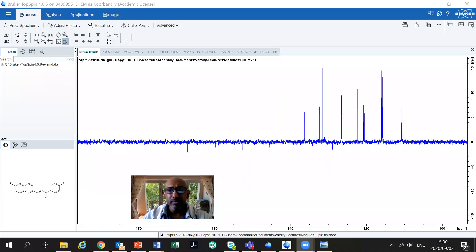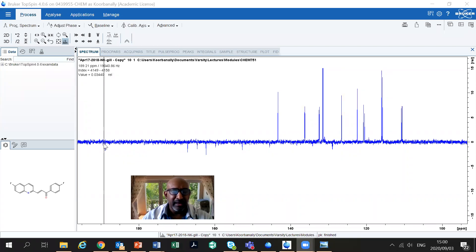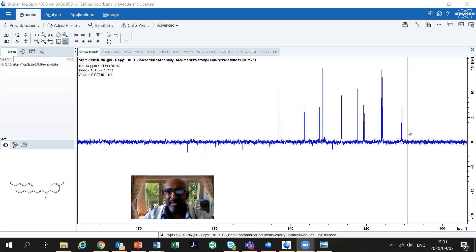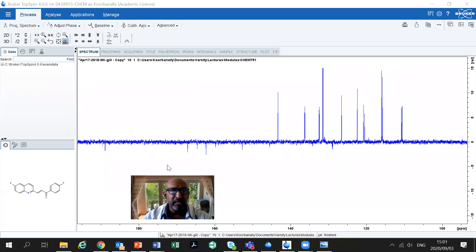We're going to come back now and have a look at the carbon-13 spectrum. In the carbon-13 spectrum, ordinarily what I would do is count the number of carbons in my molecule. Once I count the carbons in my molecule, I would then count the number of carbon peaks I have here, and I would say that my molecule is either clean or not clean, or I have some extra peaks or not.